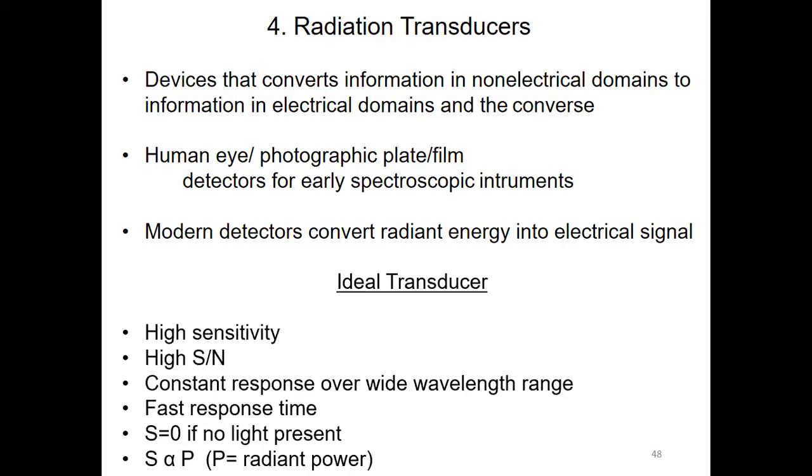Right. For a transducer to be ideal, there are a few characteristics that should be present, as listed here. The very first one is high sensitivity. An ideal transducer should be highly sensitive to the radiation change or the incoming radiation.